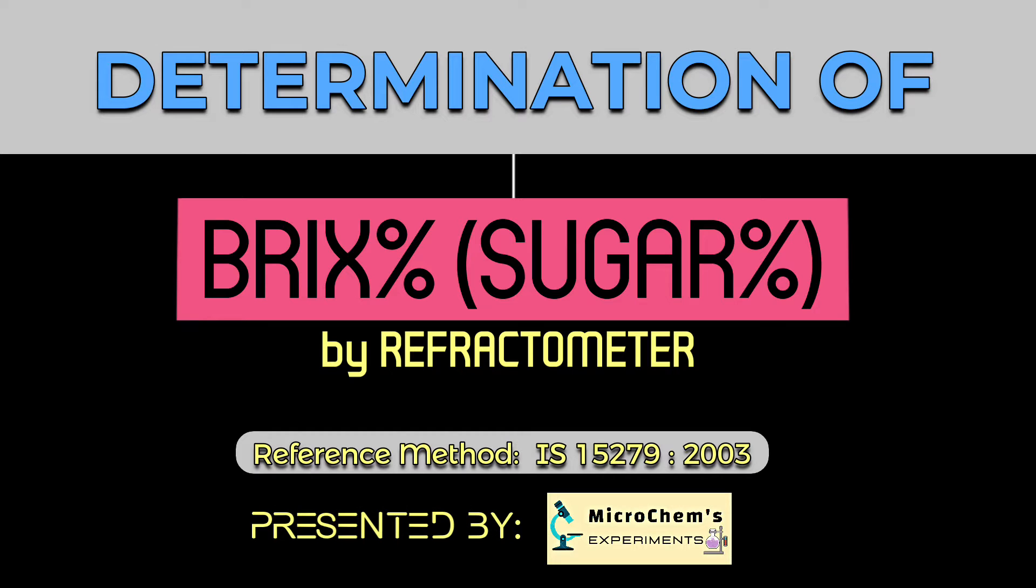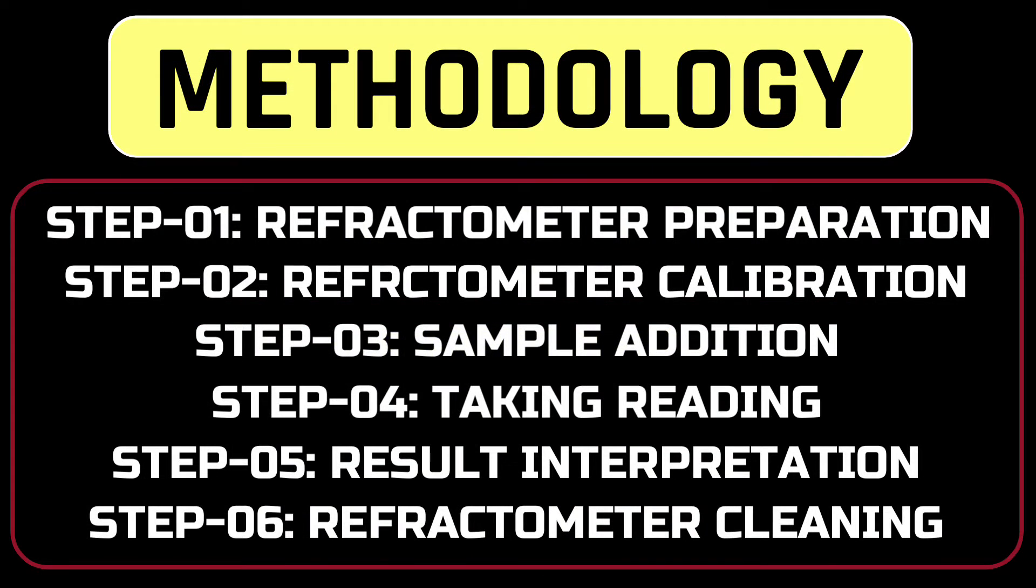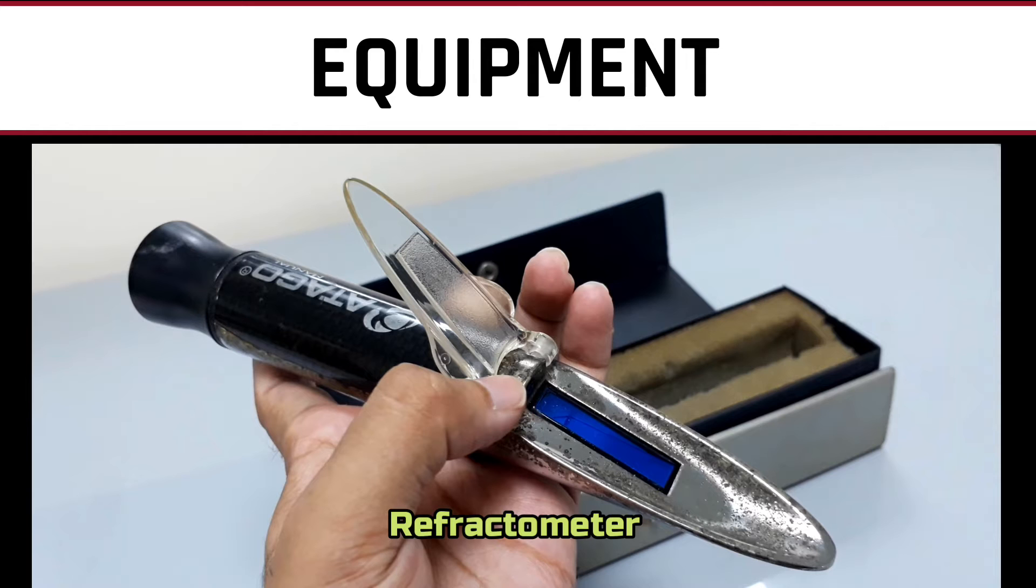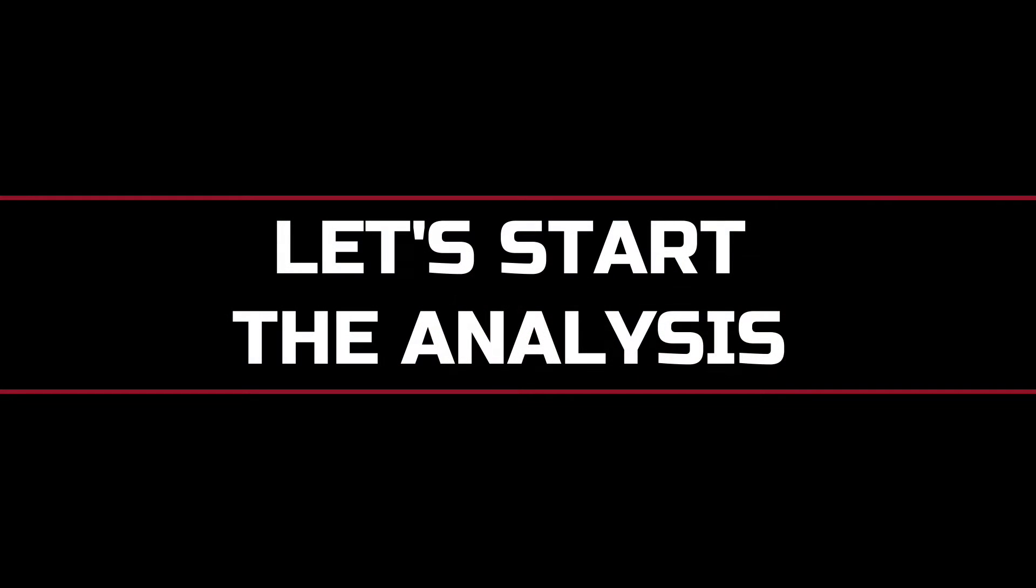Welcome to MicroChem's Experiments. This method involves six steps: refractometer preparation and calibration, sample addition, taking reading, result interpretation, and refractometer cleaning. To conduct this experiment we need only a refractometer. Let's start the analysis.